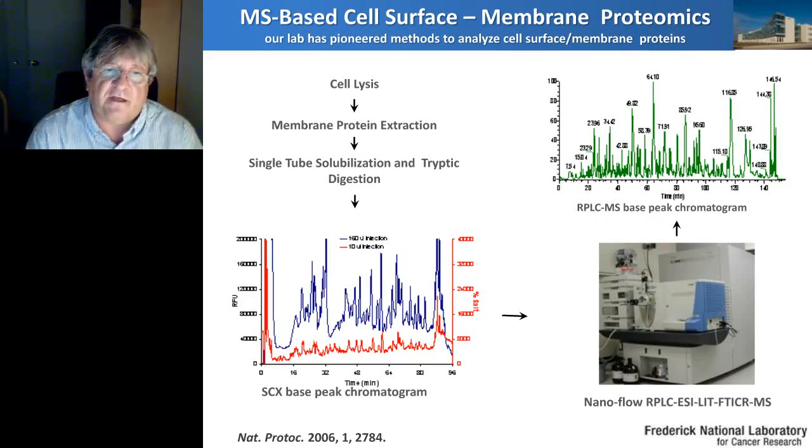As an effort of that, we have developed a shotgun proteomic approach to look into the membrane proteins of cell lines or even human tissue, using strong cation exchange as a second mode of separation of the peptides to increase the dynamic range of analysis, and using also high-end mass spectrometry with high resolution and high mass measurement accuracy.